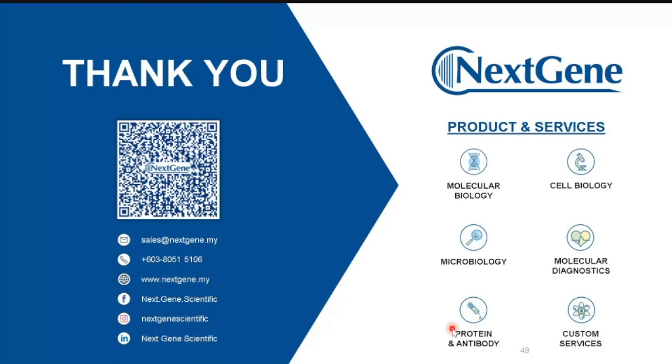If you would like to, you can do it in this format. You can say I start with the RE site, then continue with my sequence. So we will synthesize it from the RE site up to another RE site. If you want to have any modification or RE site, you need to include it in the sequence that you send to us, or you need to inform us. Otherwise we will just synthesize the sequence based on the sequence that you submit to us. Yeah, thank you, Chi Hong.